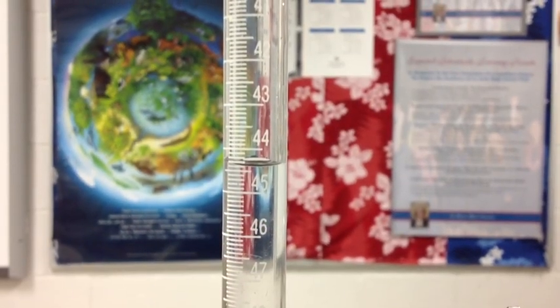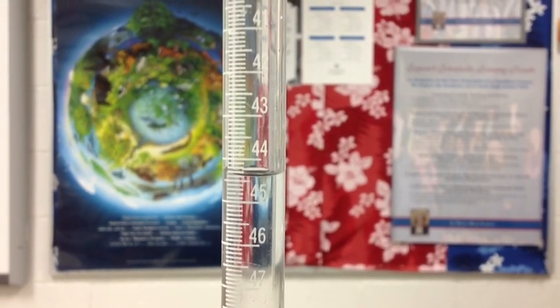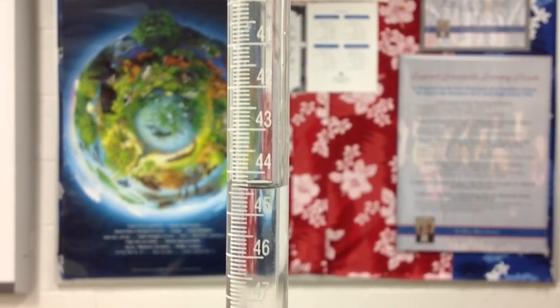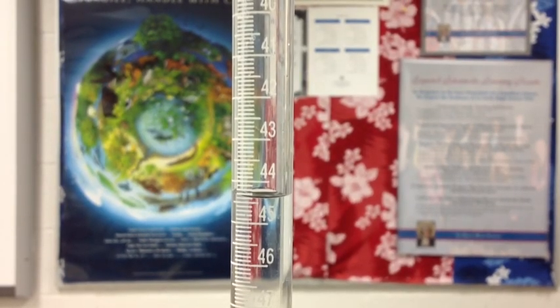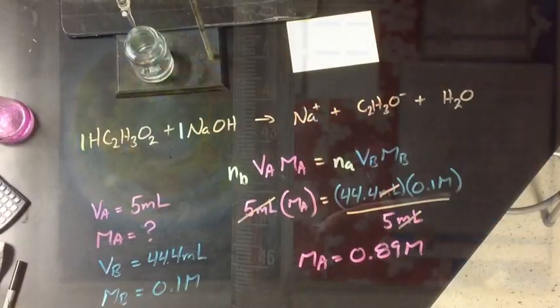Now we're going to read the amount of NaOH that we used in this titration. Reading the bottom of the meniscus on the burette tube, that gives us 44.4 milliliters.